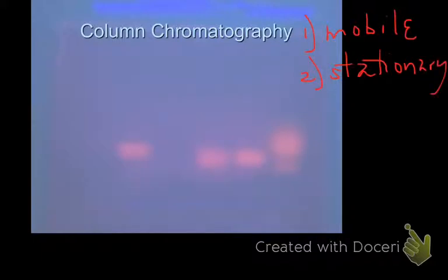With column chromatography, it's really easy to pick out which one is the mobile versus the stationary phase. The stationary phase is the one that makes up the column. It's whatever the resin or beads are that you put inside the column; they're not moving. Whereas the mobile phase is the liquid that goes through. And you can change out what resin or beads you're using to make up the column. I do expect you to be able to use logic to figure out which proteins would elute first, and elute means come off the column, flow through the column, and which ones would elute last based off of their physical properties.